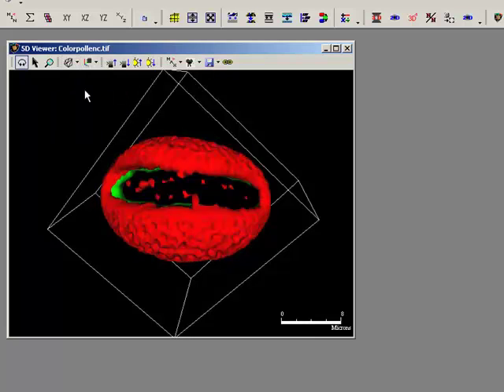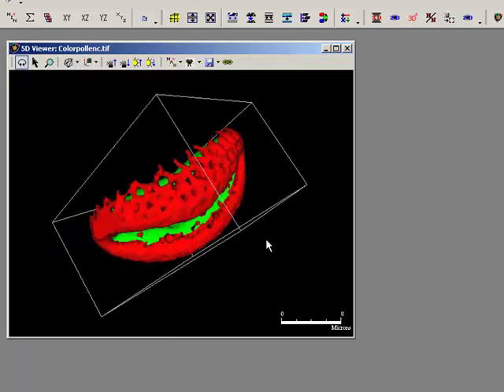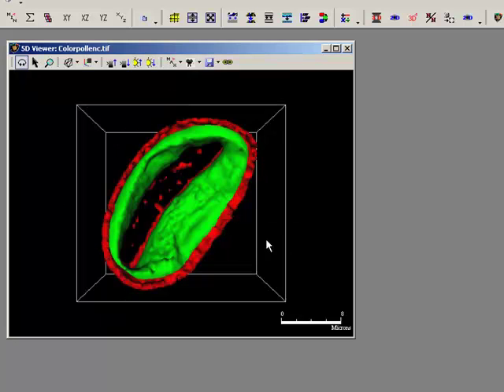And what an ISO surface basically does is thresholds the image and represents all the intensities within the threshold as a single intensity. So there's no kind of grayscaling here. There's no dim or bright objects. It's just a thresholded image in 3 dimensions effectively. So I can rotate around here. I'm going to go back to my home position.